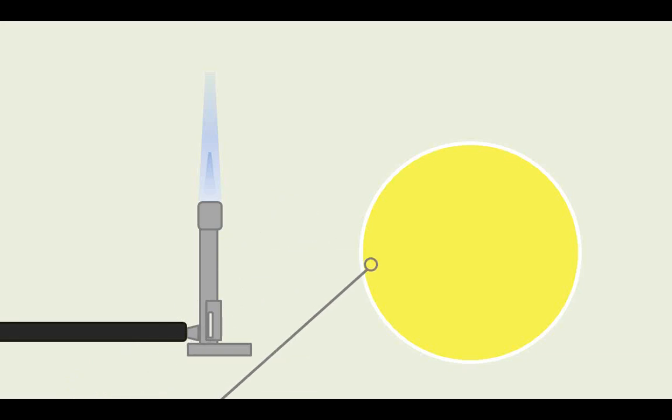Begin by taking a loopful of your sample and spreading it across the surface of the plate in a zigzag motion.